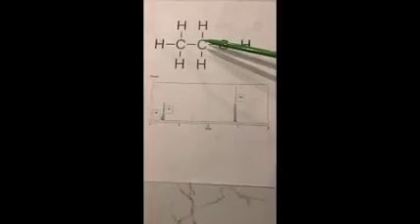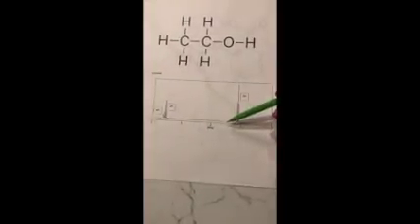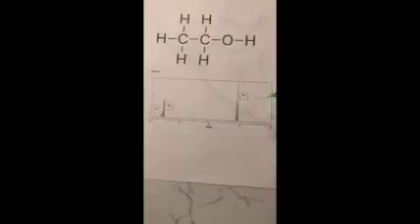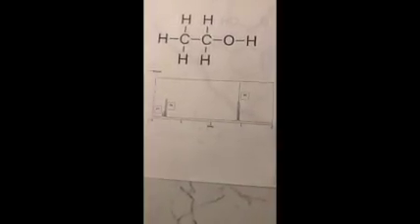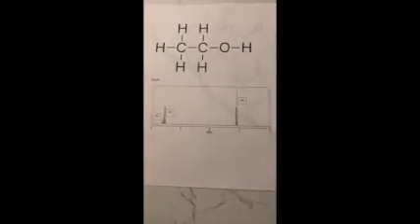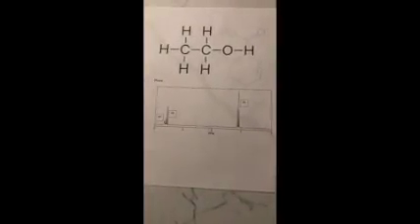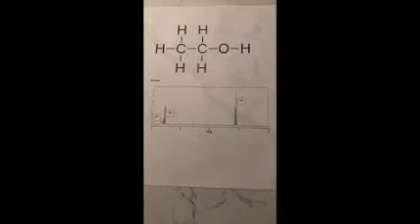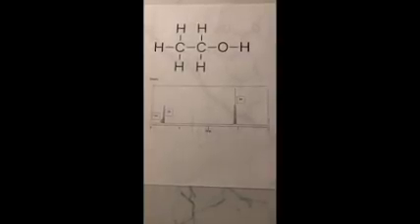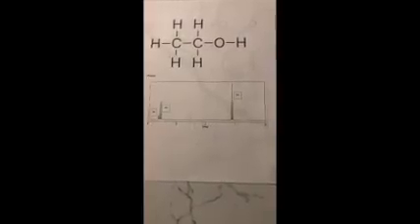It's also related to the applied magnetic field, which is generated when you are taking the HNMR spectra. Another thing that also affects the position of the signals is called shielding and deshielding, which is also related to the chemical environment. A nucleus is said to be shielded if it is relatively electron rich, so that means that the effect of the applied magnetic field is counteracted a little bit by the magnetic field generated by the valence electrons.